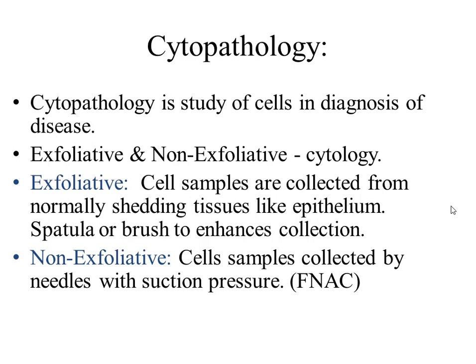Exfoliative samples of cells are collected from normally shed tissue like epithelium, with a spatula or brush to enhance collection. Non-exfoliative cell samples are collected by a needle with suction pressure, fine needle aspiration cytology.